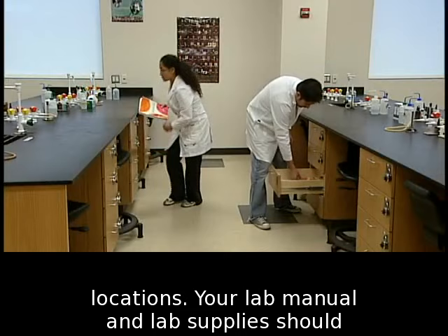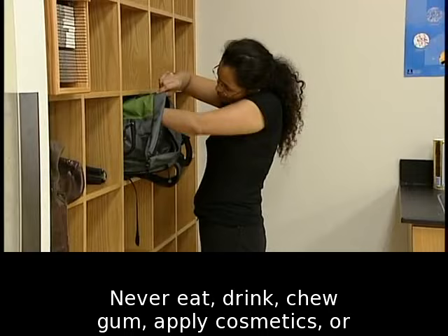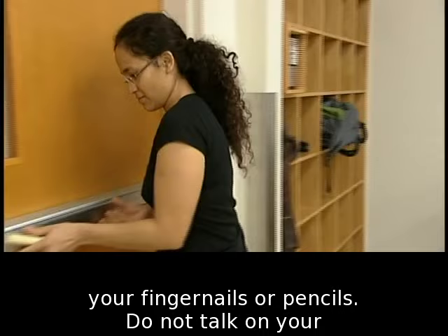Never eat, drink, chew gum, apply cosmetics, or handle contact lenses in the lab. Do not nibble on your fingernails or pencils. Do not talk on your phone or text during lab.